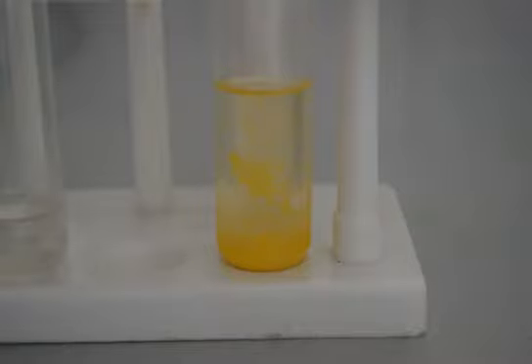So there you can see the precipitate forming straight away and then falling down. Do it again. Oh, and a bigger blob there, perhaps more than one drop, and then another drop forming, and then we'll do a run of drops.